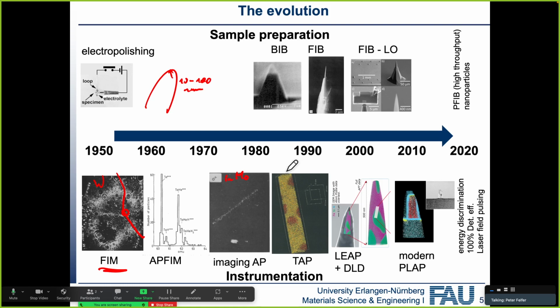What they did was they bought a detector from astrophysics and used that one because it had a time resolution and a spatial resolution. But the spatial resolution wasn't all that great, and it didn't have a lot of capacity for two atoms coming at the same time. It was a so-called wedge and strip detector.